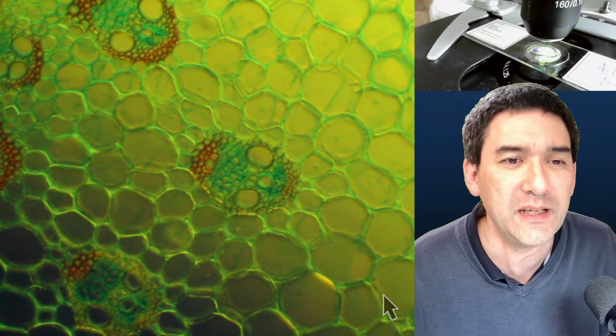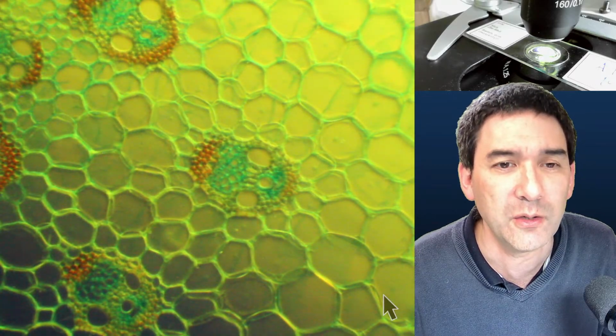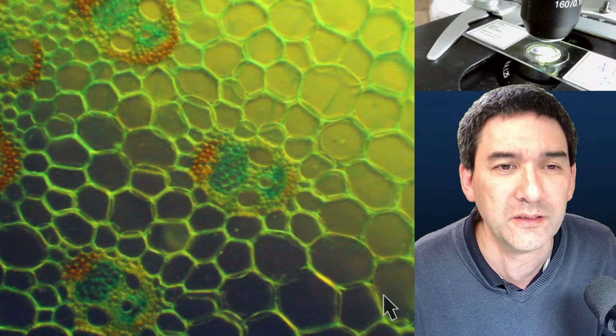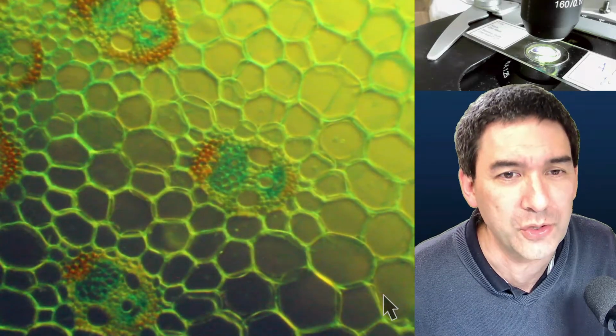So this is, again, an interesting question to figure out. This is again a combination between Rheinberg and oblique. And it's so much more clear when directly looking through the microscope.